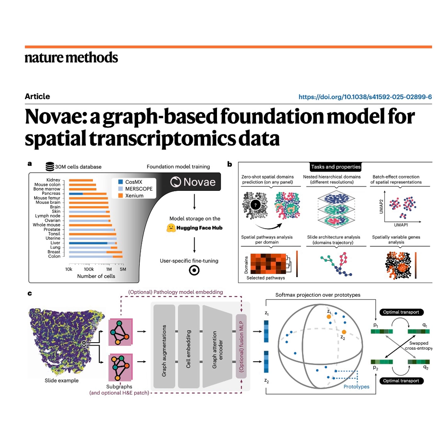It is. And they also noted the expansion of a new domain, D498, which was highly enriched in a chemoattractant called CXCL12. This strongly suggests that the model isolated and highlighted a newly formed inflammatory cell recruitment area, which is crucial to the node's immune response, a dynamic change that older, batch effect-prone tools likely would have just missed.